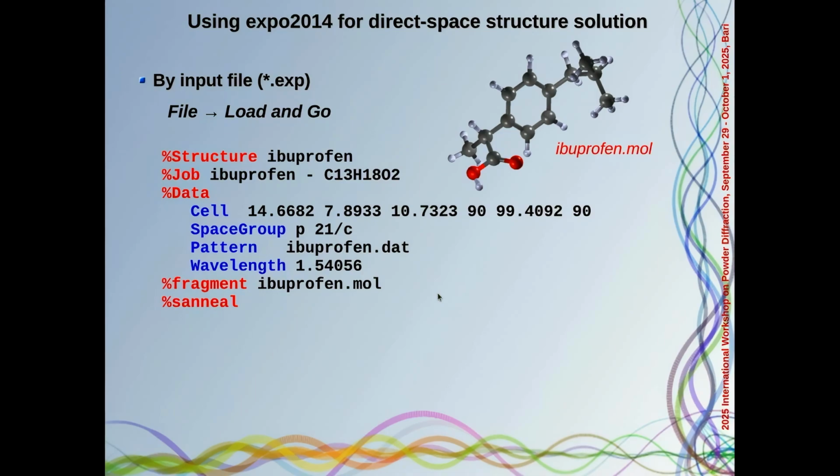Just as a reminder, this is the typical input file for the structure solution by real space method.